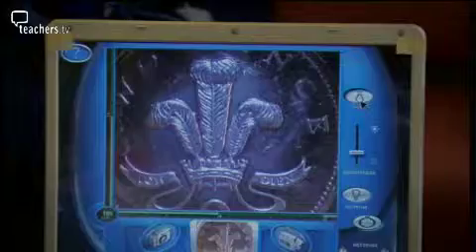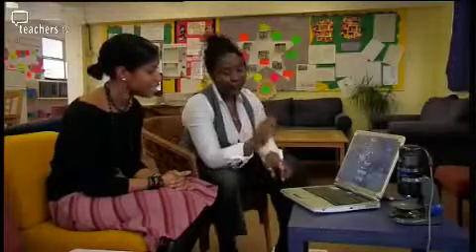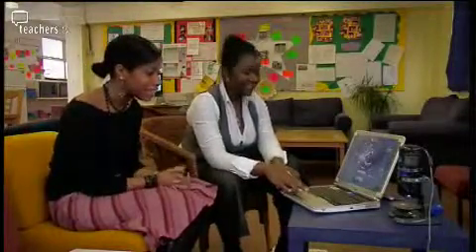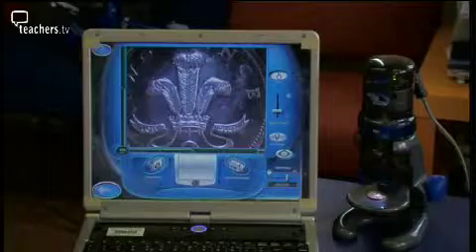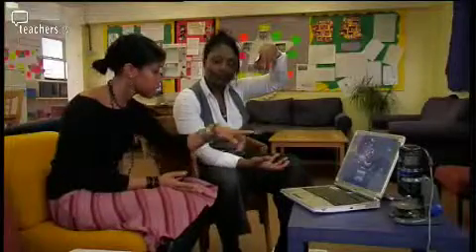This is the software interface. Basically, it helps you to control the microscope. It makes funny noises as you mouse over the various bits and pieces. The children like that. This icon is for the top light, so you can actually arrange it so that the light is on top of your subject. Is that the light that's showing at the moment? That's the light that's showing at the moment.